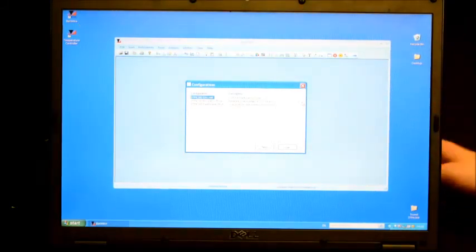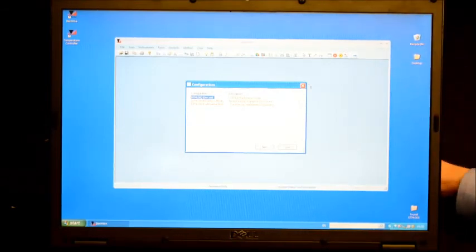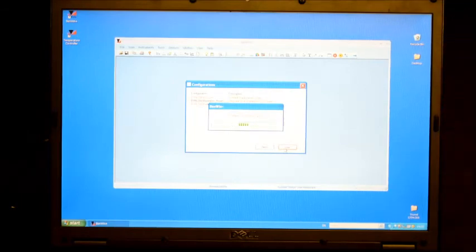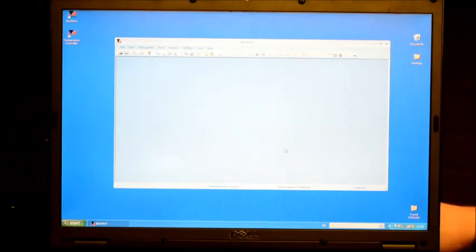benwinplus, on initializing, will show two configurations relevant for this system. The two configurations are DTMC300 EnviroBox mode and DTMC300 radiometer mode. One should select the appropriate mode. So in this example we will look briefly at the EnviroBox mode. One can either double click or hit use, and the system will initialize. A noise of the various motors in the system parking will be heard. And now benwinplus is ready for use.